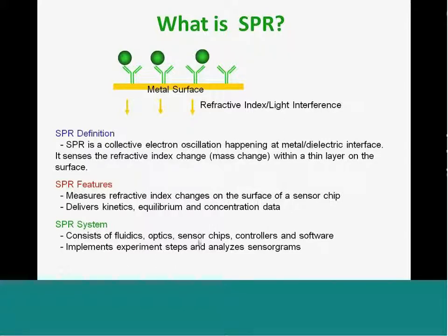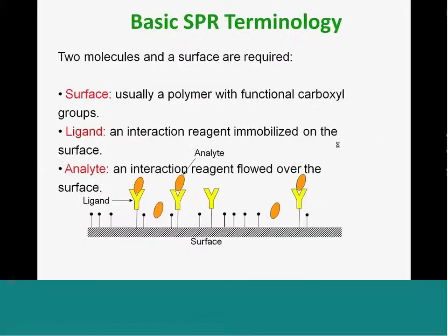The SPR system consists of fluidics, optics, sensor chips, controllers, and software, which is relatively easy to use. We've been trained on it. My technician knows how to use it quite easily. So it's a very easy interface, and very easy to design experimental steps and then analyze sensograms.